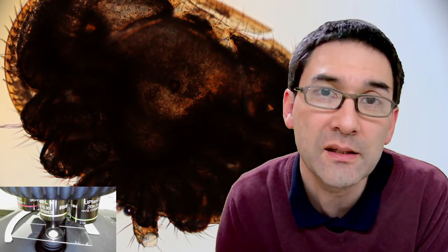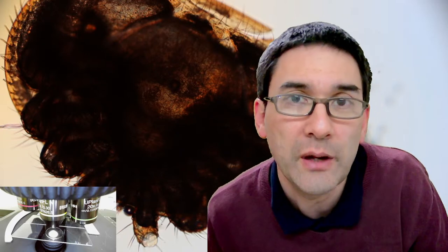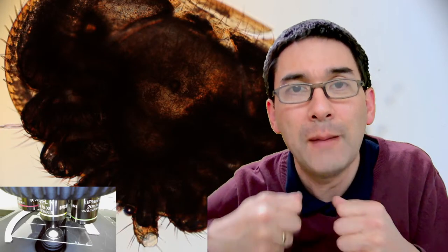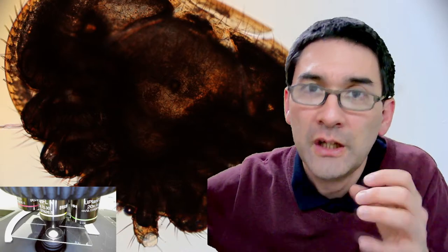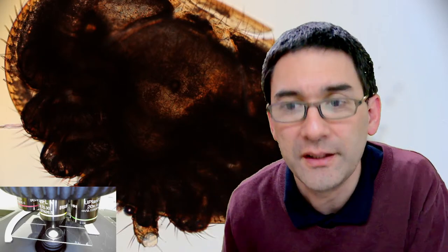Now, of course, when you degas something, there could still be some air in the specimen itself. So if I'm degassing, for example, a mounting medium, then there could still be some air in a specimen. My guess was that maybe, and I've not tried this, you could take those slides and also degas them by applying a vacuum. Because of the low pressure, the air is going to be sucked out. The bubbles will expand and float to the side. Then when you have normal air pressure again, it's going to collapse and the bubbles are gone. This is kind of the idea, but I have not tried it.